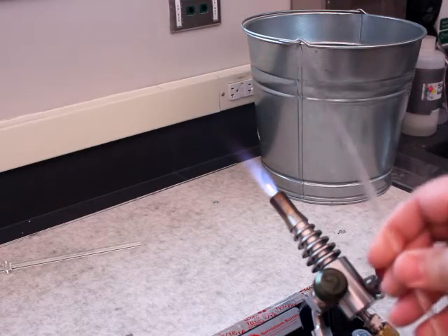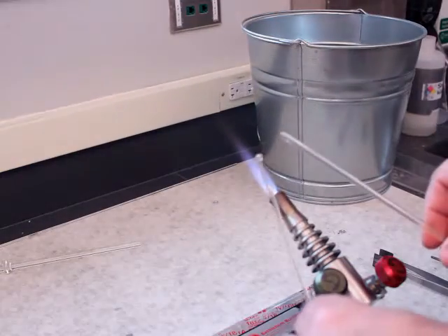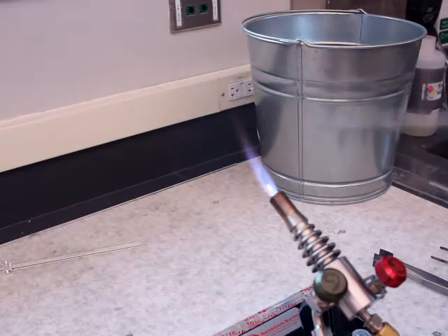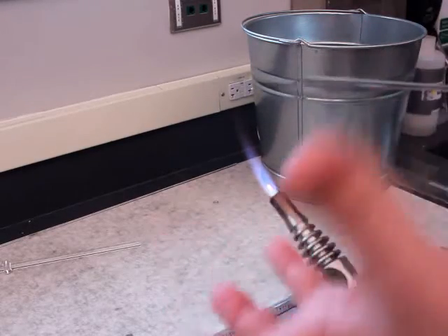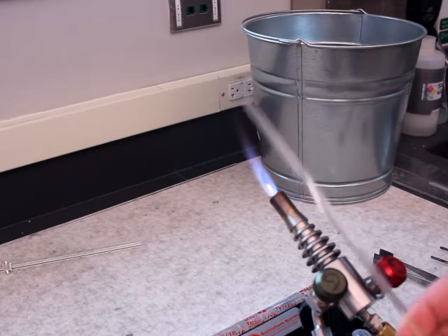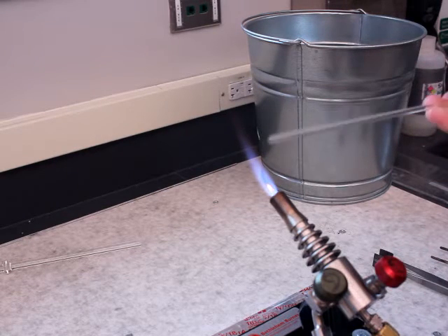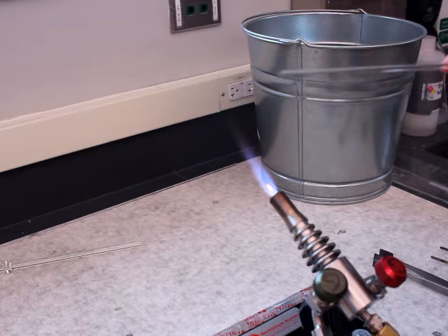If I wanted to, I could keep heating and get myself to where I'm actually making a sphere on the end — making an actual ball, basically making a gather in this case. But I don't want it to get very large because I just want a nice clean end for my rod.